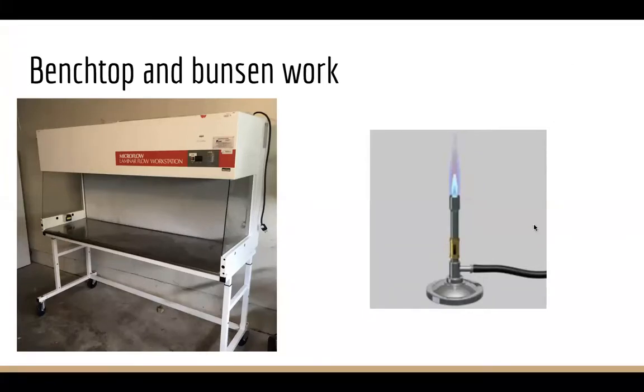And they're just supplied with gas. So the main cost is the gas supply, and it's quite cheap, and you can use it on any table. So yeah, that's one way.